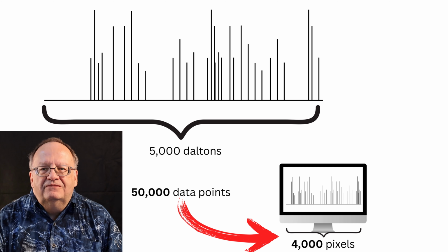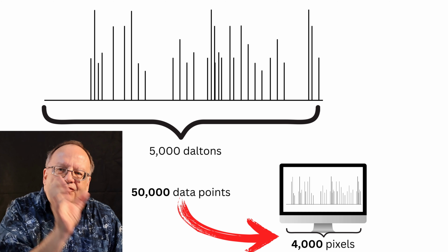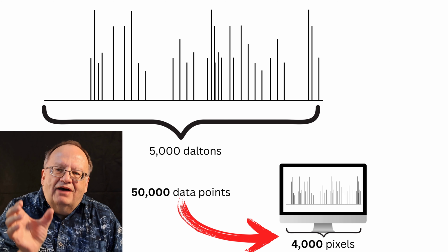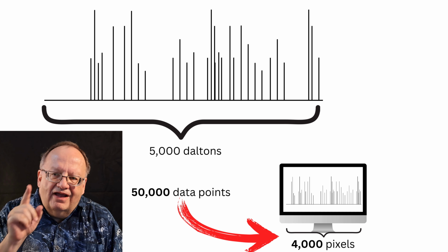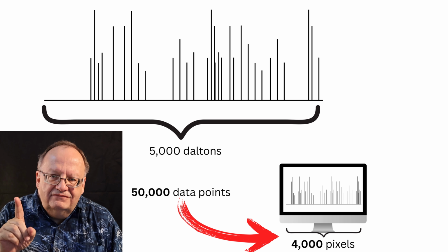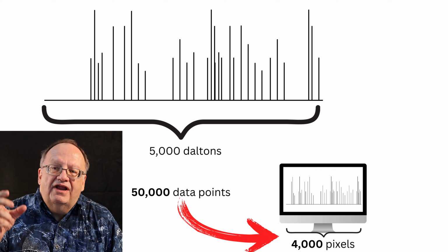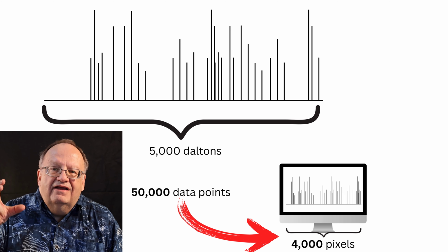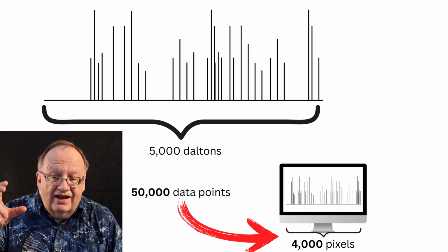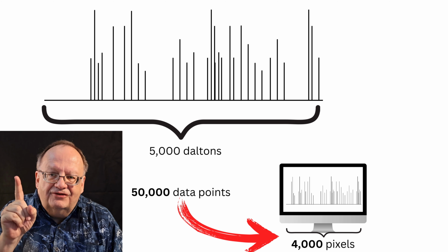No guidance. Okay, well, if I don't have any guidance, then I'm going to go through this spectrum by hand over and over and over again until I find something that's interesting. And remember, I don't have one tissue sample. I don't have one subject. I probably have 40, 100, maybe 1,000 if I'm doing a big study. I've got a lot of data, and I cannot go through all this stuff by hand. So, that's our first problem.